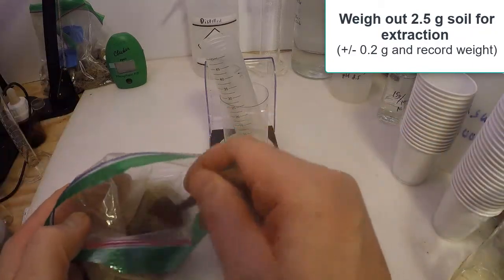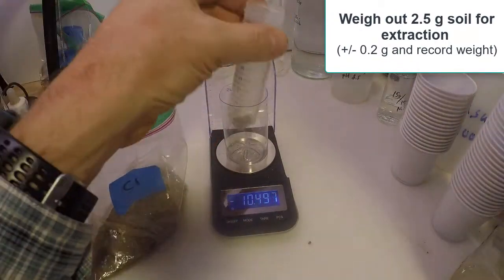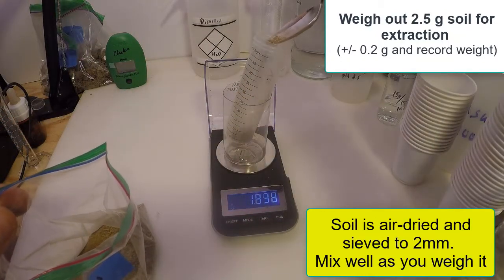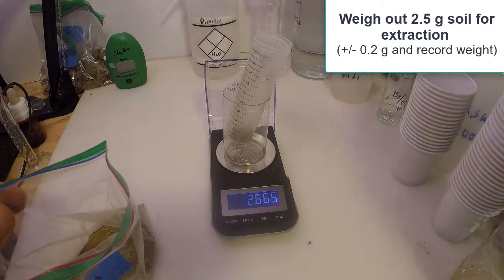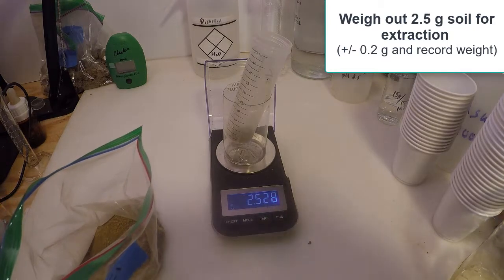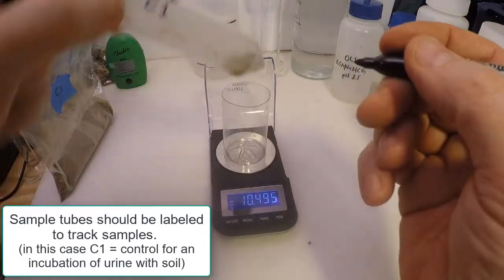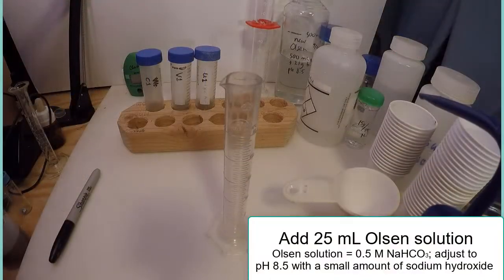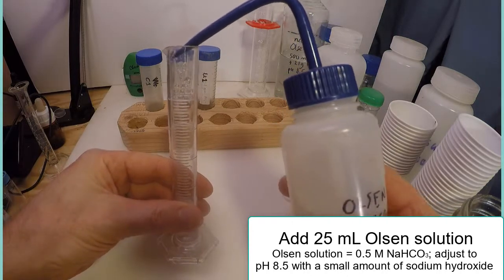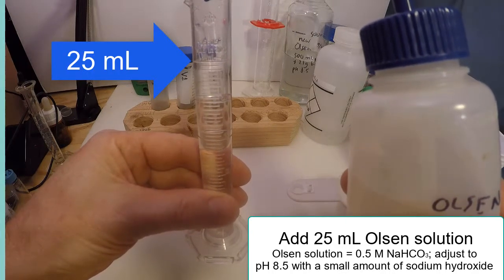The first step in the procedure is to weigh out two and a half grams of soil, which can be either field moist or more usually air dried soil. Then 25 milliliters of Olsen extraction solution are added to the soil. Olsen solution is sodium bicarbonate in water, adjusted to a slightly basic pH with sodium hydroxide.